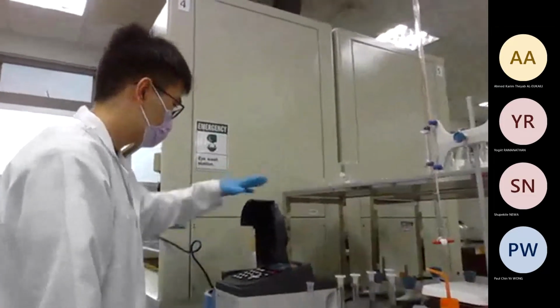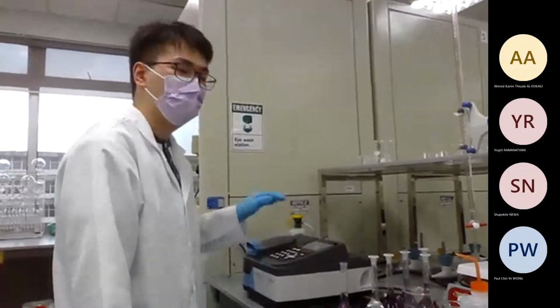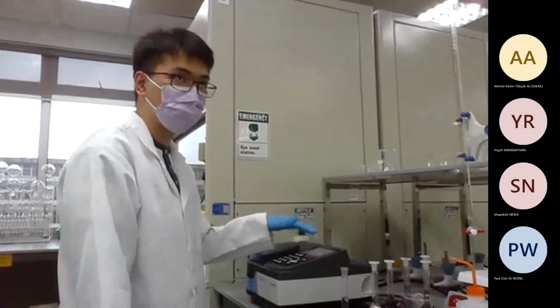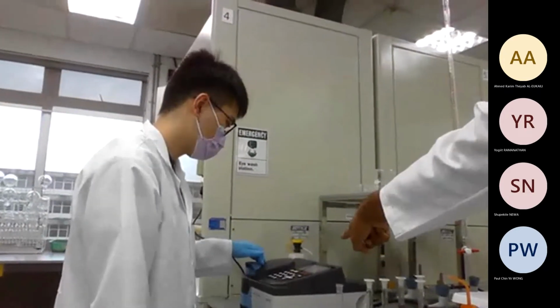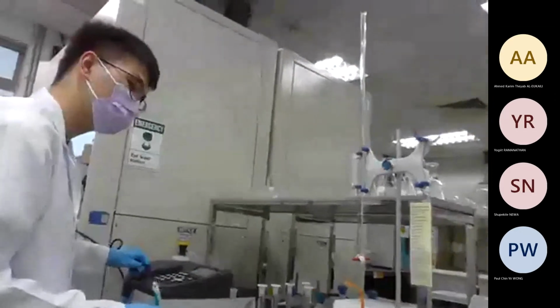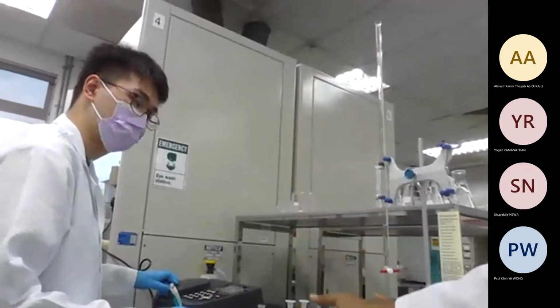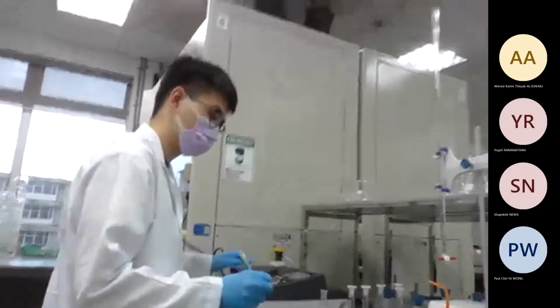Can you close the lid? Yes. Is there anything I should record down? No. Just record down the absorbance. That is blinking, right? That you should put it here. Record it here, and then nothing to do. No need to press anything. Just take another cuvette, take sample, put that, and then record the data.